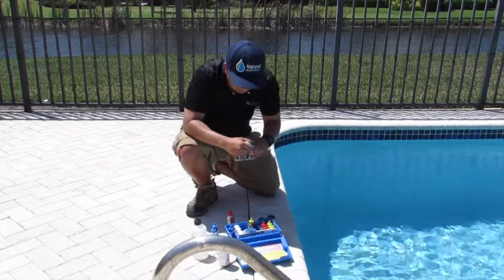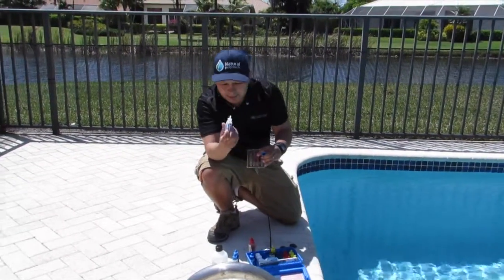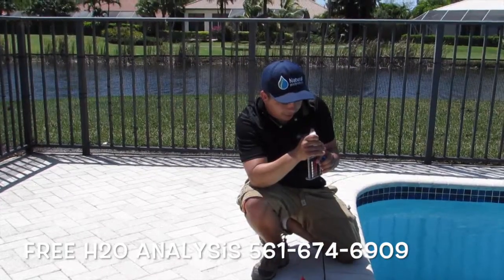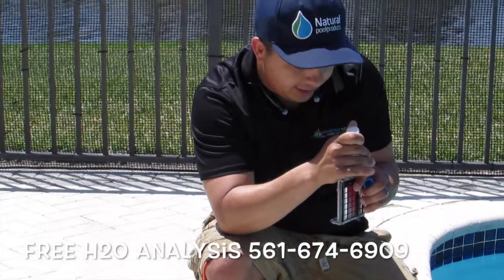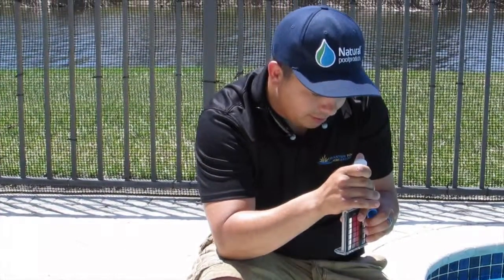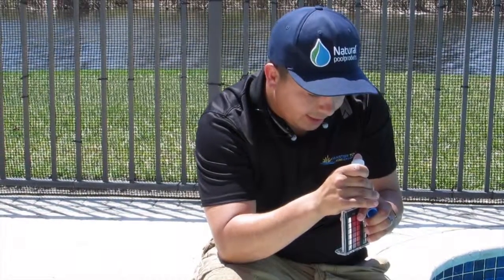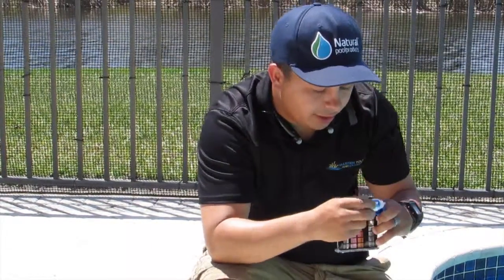It tells you to drop 20 drops of the R10. Counting out 20 drops total.